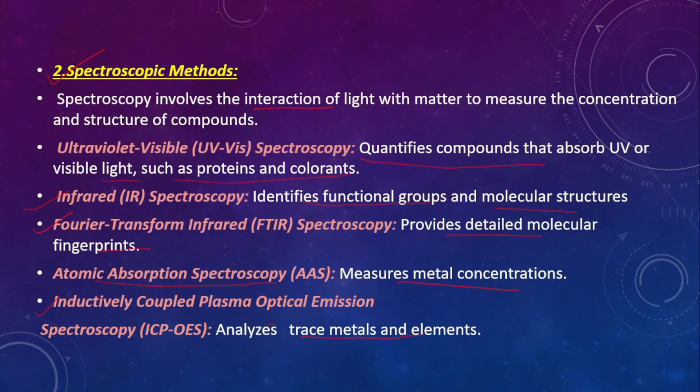Another one is Raman spectroscopy. It helps in identifying the molecular composition in complex food matrices, detection of contaminants and adulterants, analysis of carbohydrate structure, and monitoring fat crystallization and protein folding during food processing.